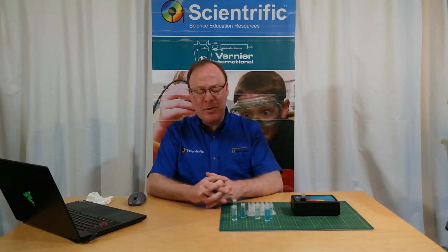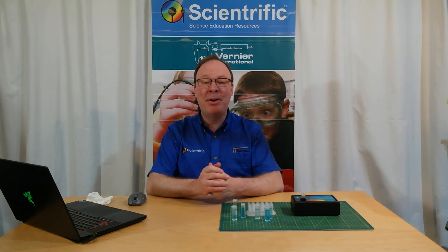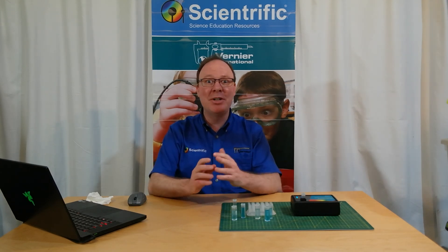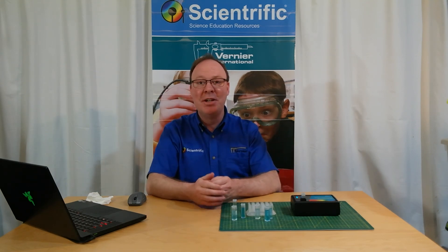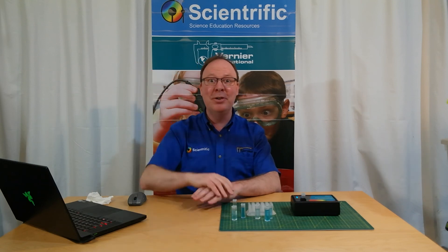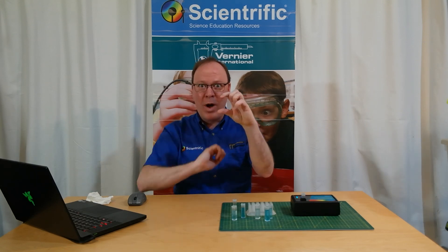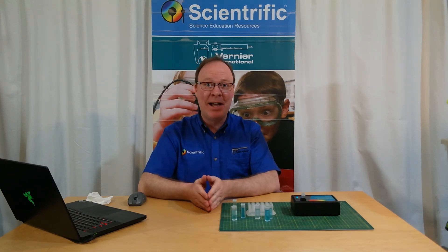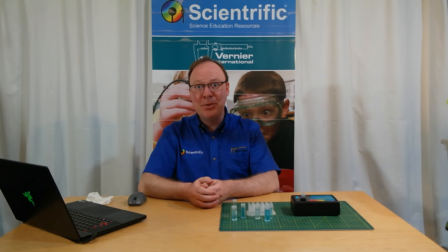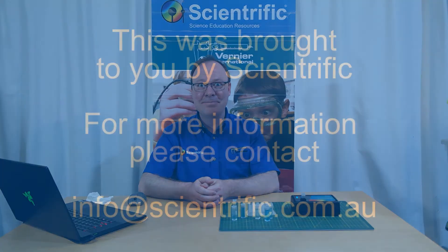Beer's Law experiments are incredibly powerful and can be used for a whole lot of purposes. If I'm doing a field trip, the easiest way to measure nitrates, phosphates, and calcium in the water is to use a testing kit which allows me to set up different concentrations. Back at the lab, I can set up my Beer's Law curve — that straight linear fit — and then in the field, I just need to do that one cuvette, pop it in, and get a reading. If you do have any queries, please feel free to contact me on the following email address. Thank you.